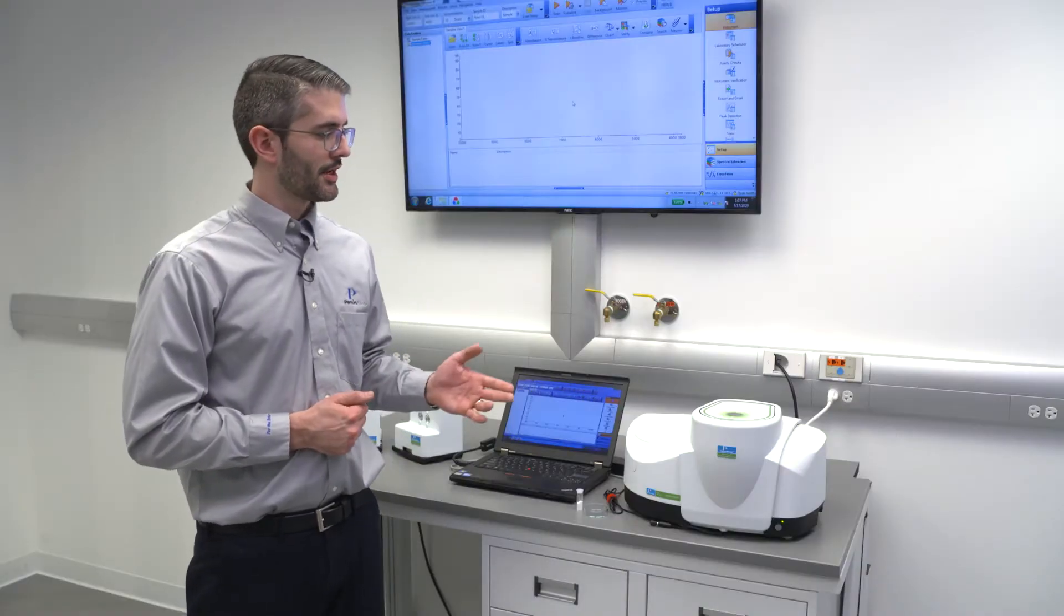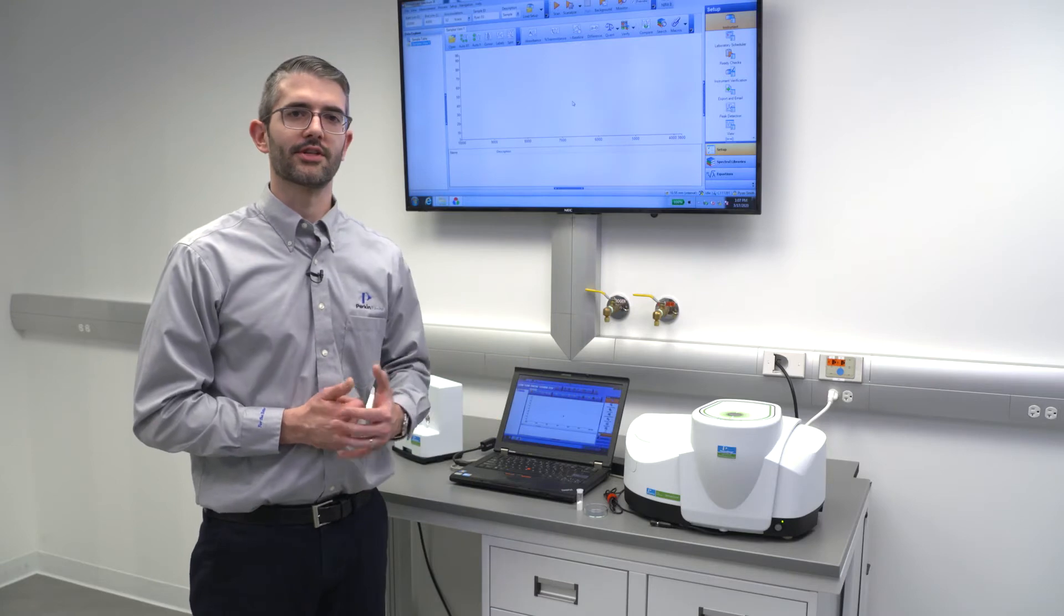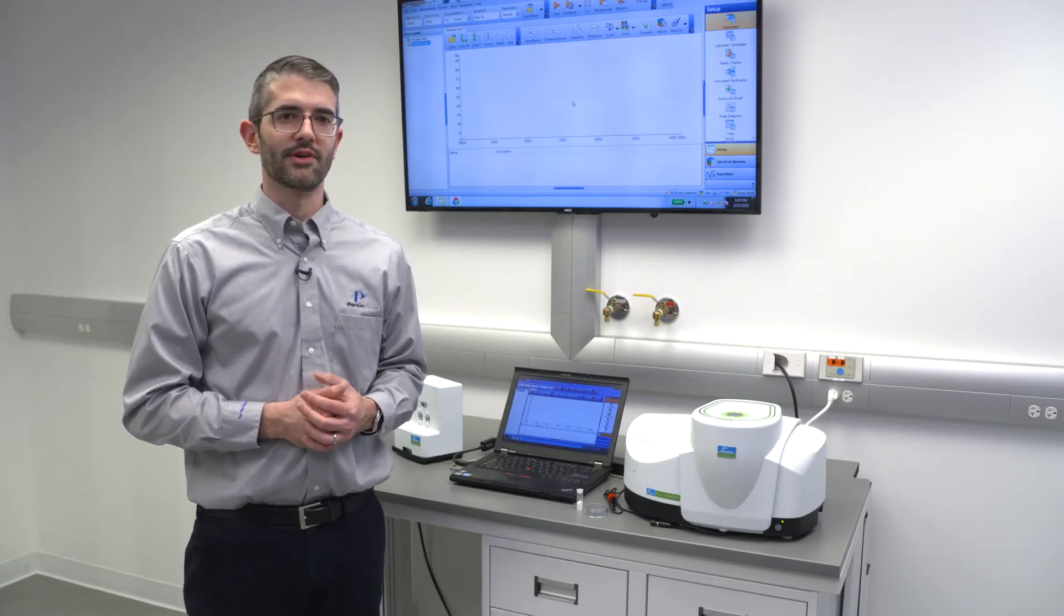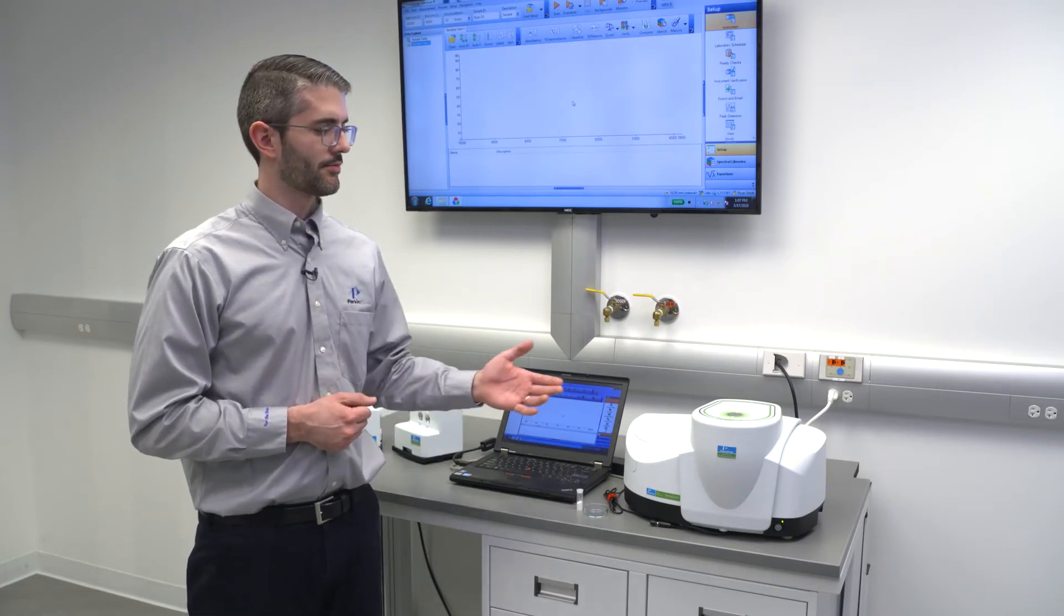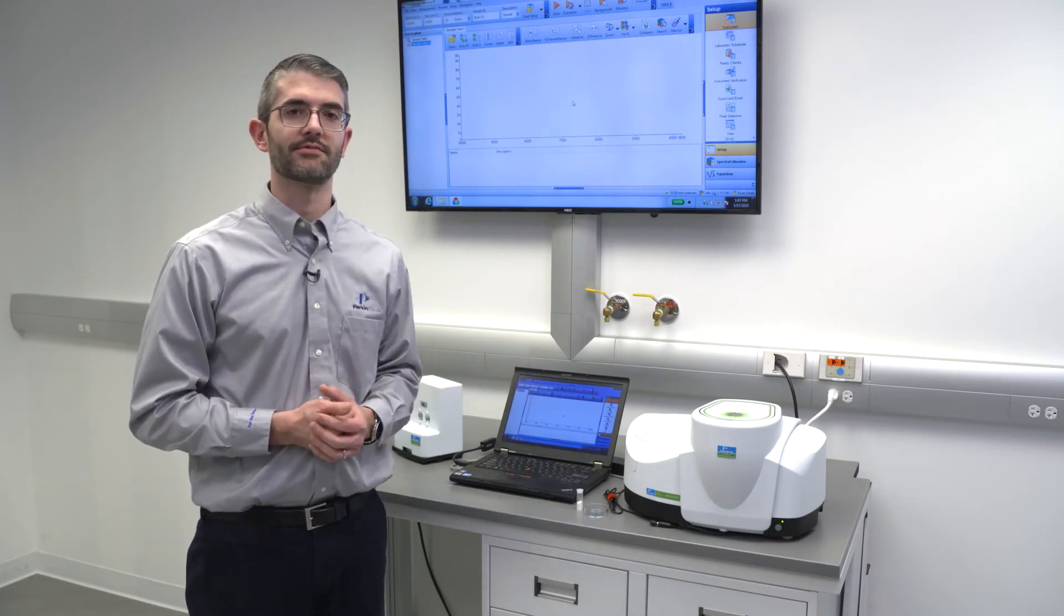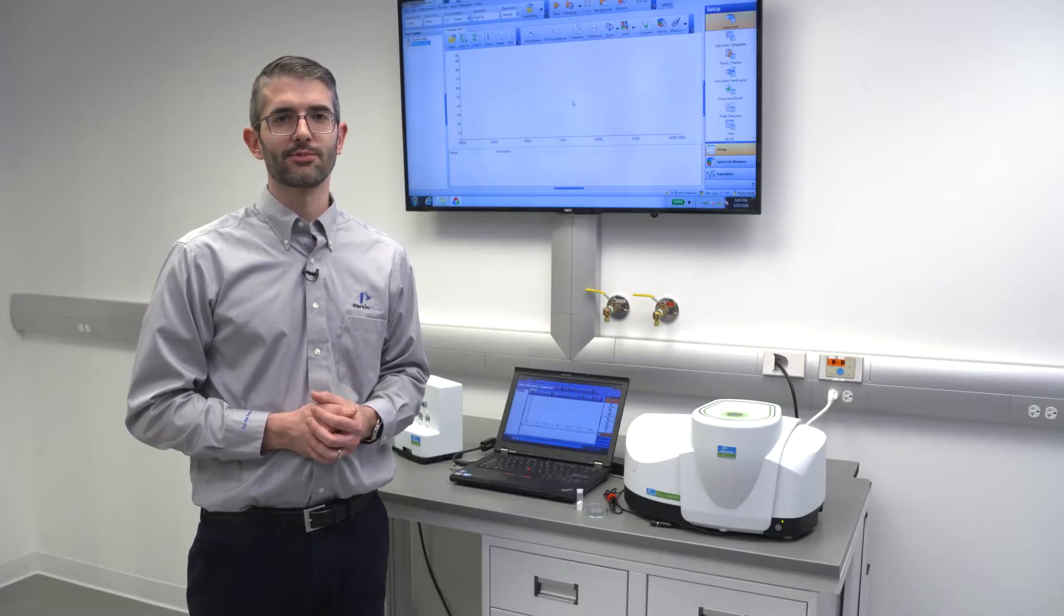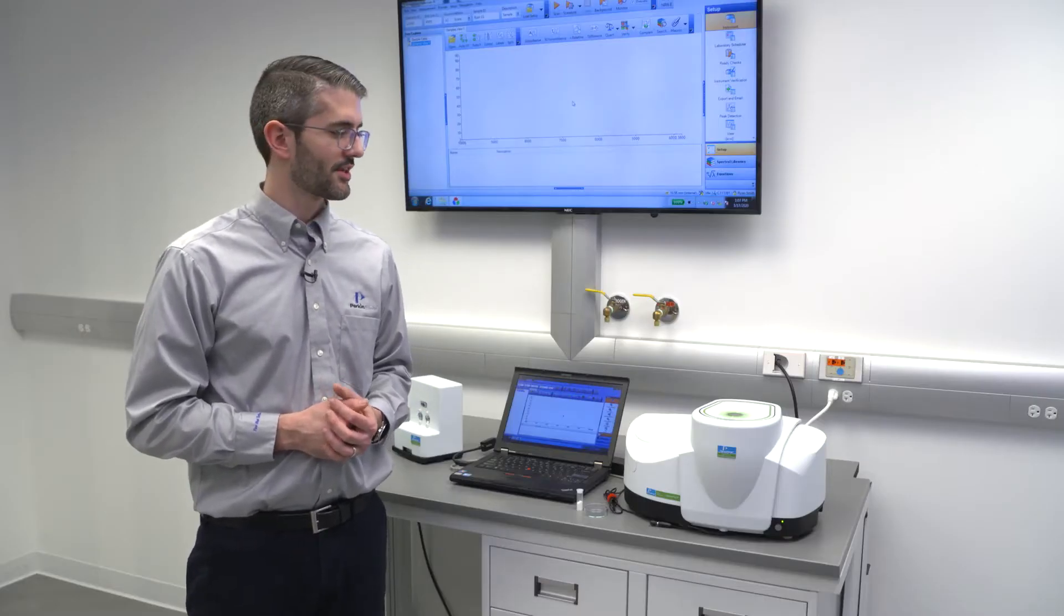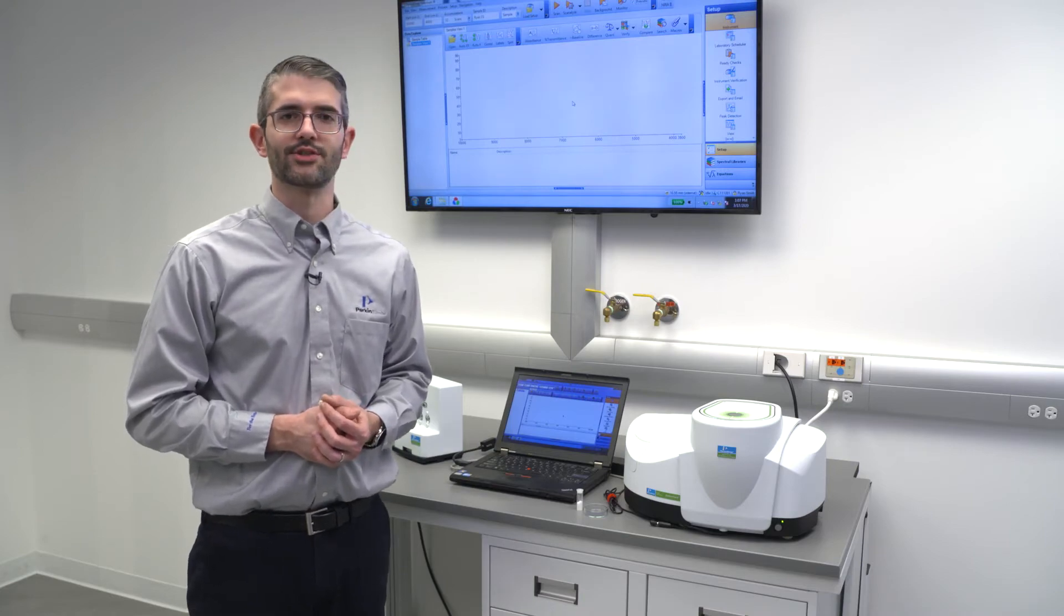The Spectrum 2N also benefits from our optics guard technology, which provides a very high lifetime of the desiccant that protects optical components critical to the operation of the FT-NIR. The desiccant lifetime is extended so much by this technology that we warranty the desiccant for three years from the factory, though many customers have achieved desiccant lifetimes extending beyond six or seven years.